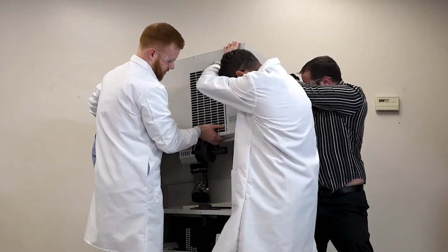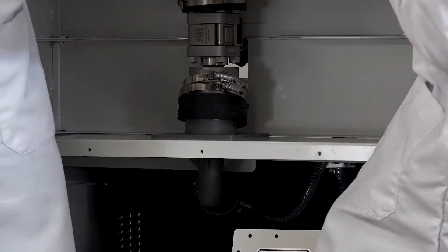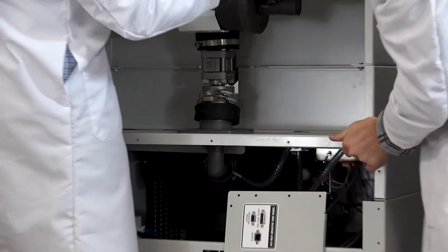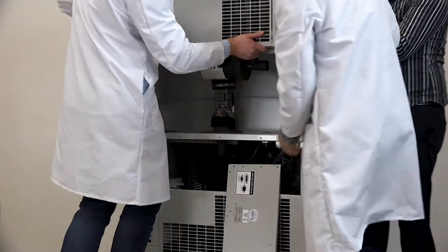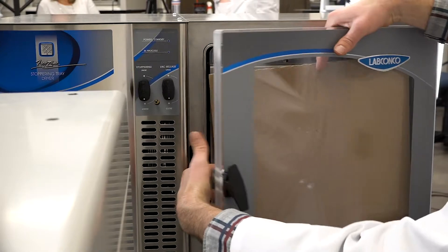Lift the stopper and tray dryer into place on your freeze dryer while centering the vacuum coupling over the vacuum connection port. Do not lift the stopper and tray dryer by the acrylic door.